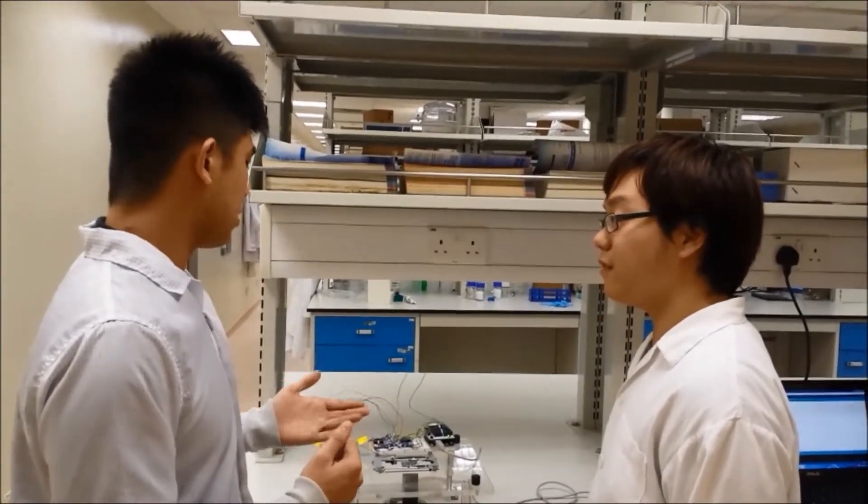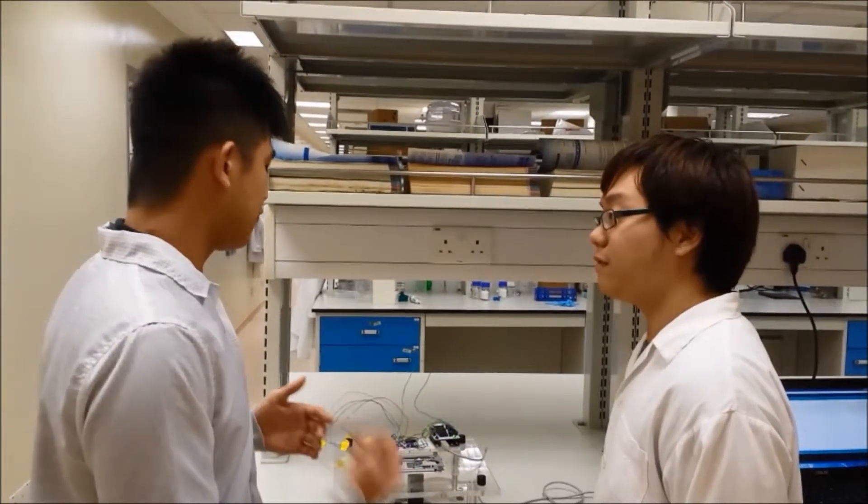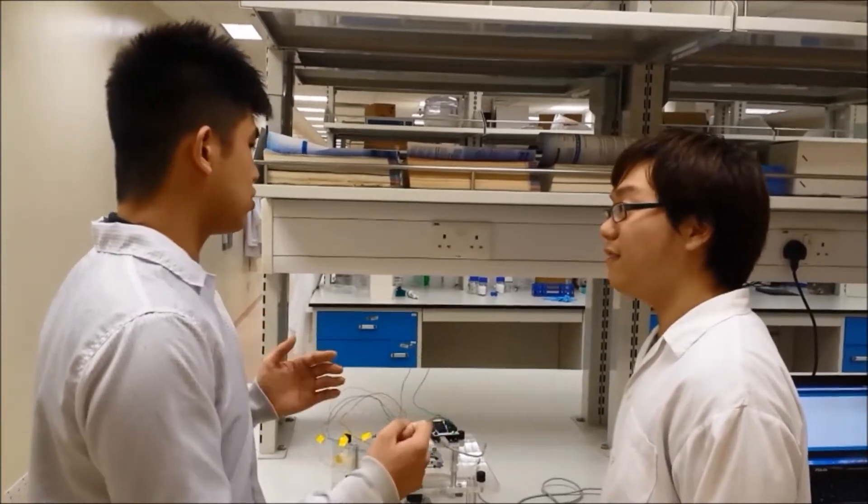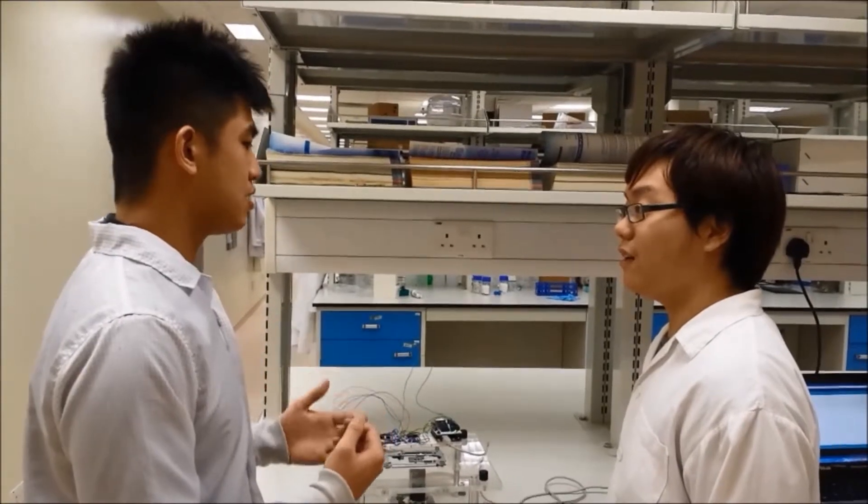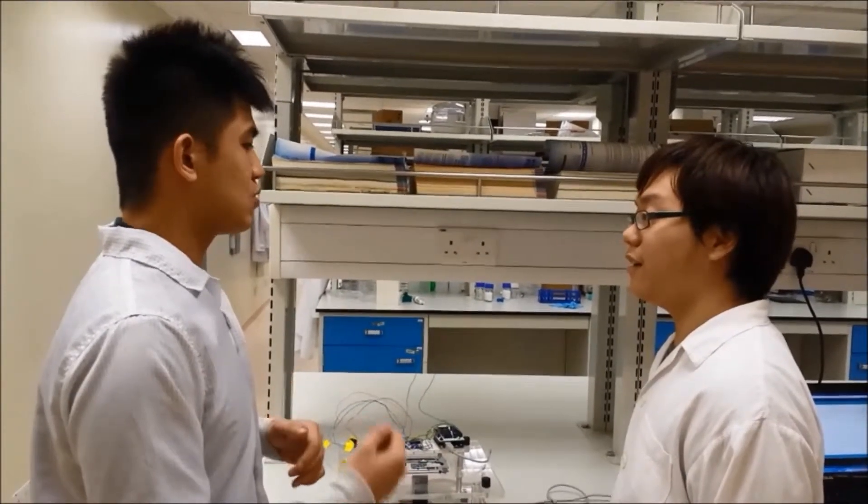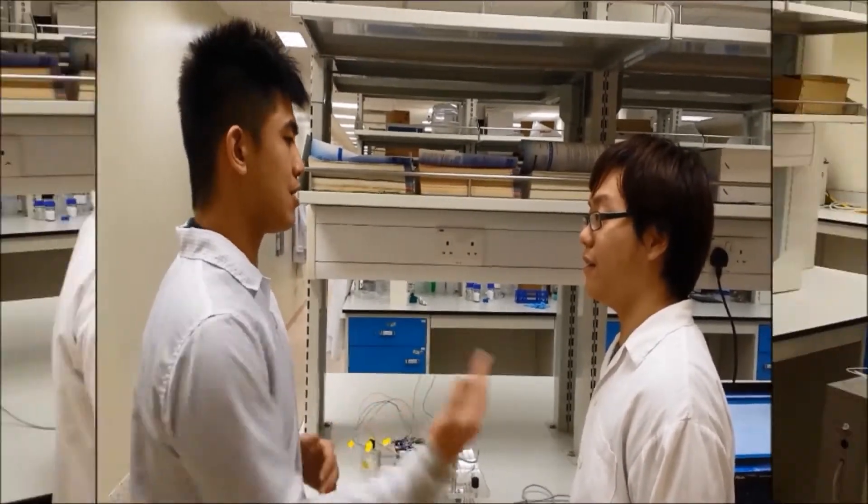Basically, the ink shield controls the printing mechanism within the ink cartridge, while the Arduino receives codes from the computer to facilitate the printing process, which will be further elaborated by my colleague.